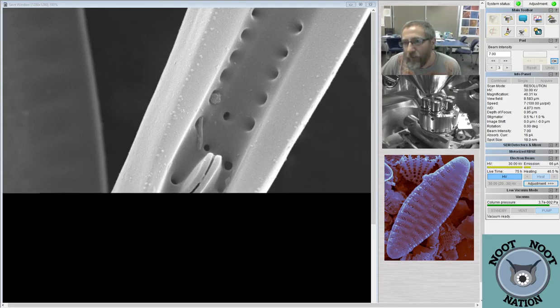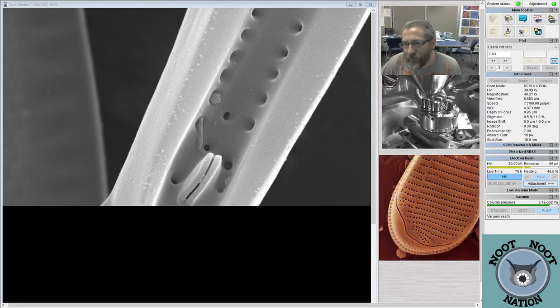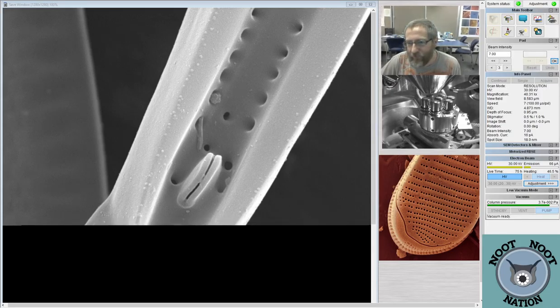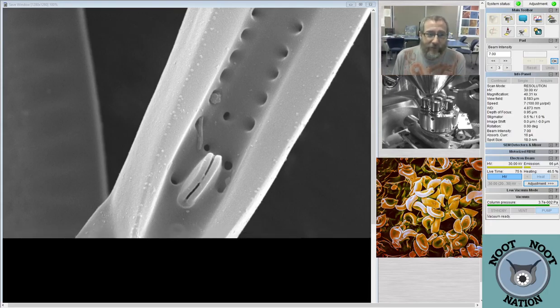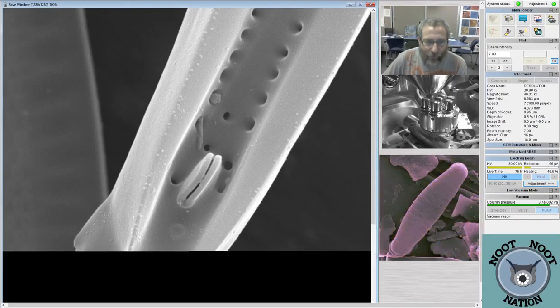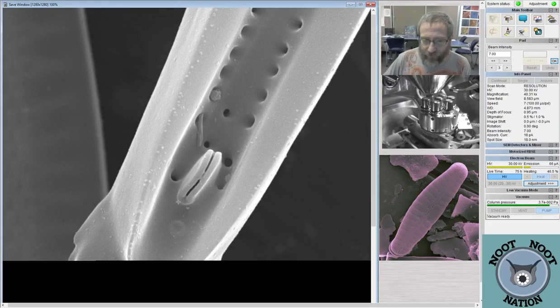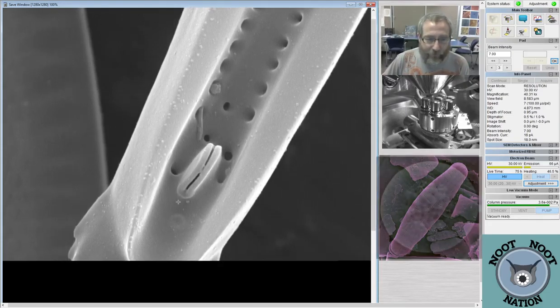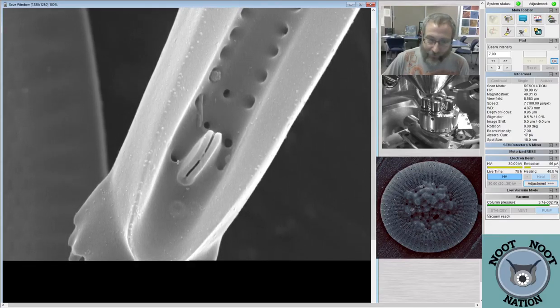Okay, so I'm still coming back to Thalassiothrix. Oh, well, that's totally possible. So yeah, this structure that you see that looks like a mouth, that's the Rimoportula. And for Fragilaria, things that belong in the class Fragilariophyceae or whatever, they will typically have just one Rimoportula on one end. So we pick the right end.